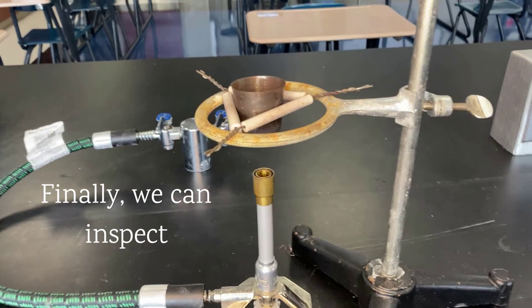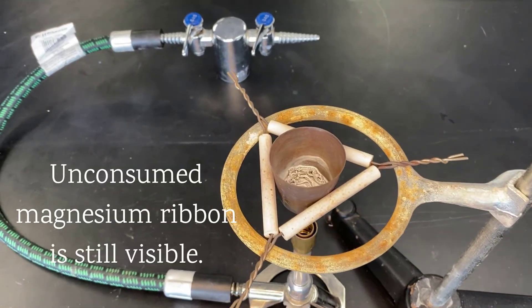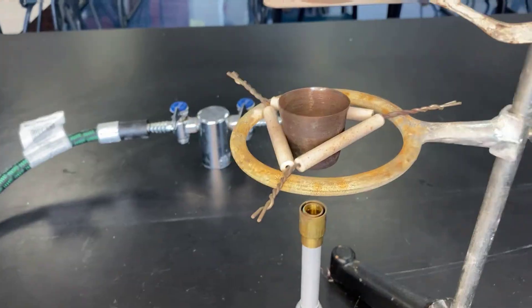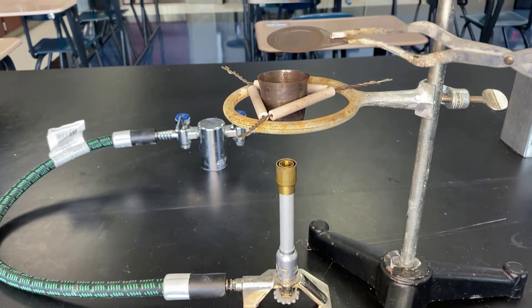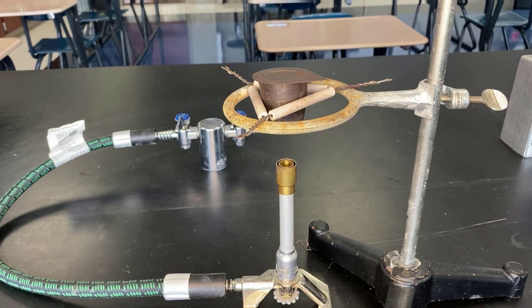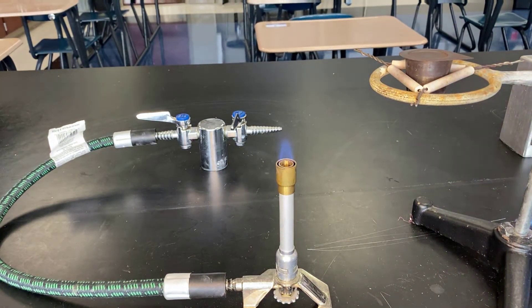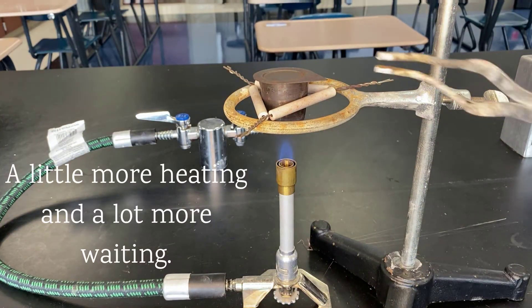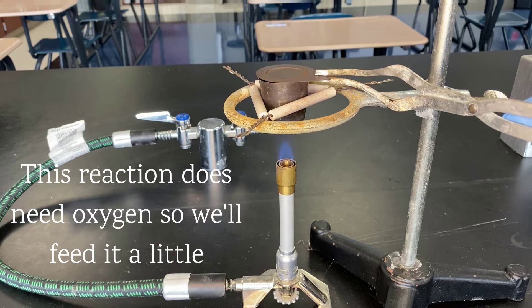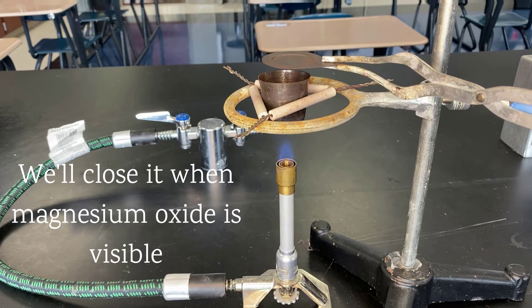You can see that there might be some unreacted ribbon. I'm going to go ahead and heat it back up, and so we're going to let it breathe a little bit. At the first sign of any magnesium oxide escaping, I'm going to go ahead and put the lid on.